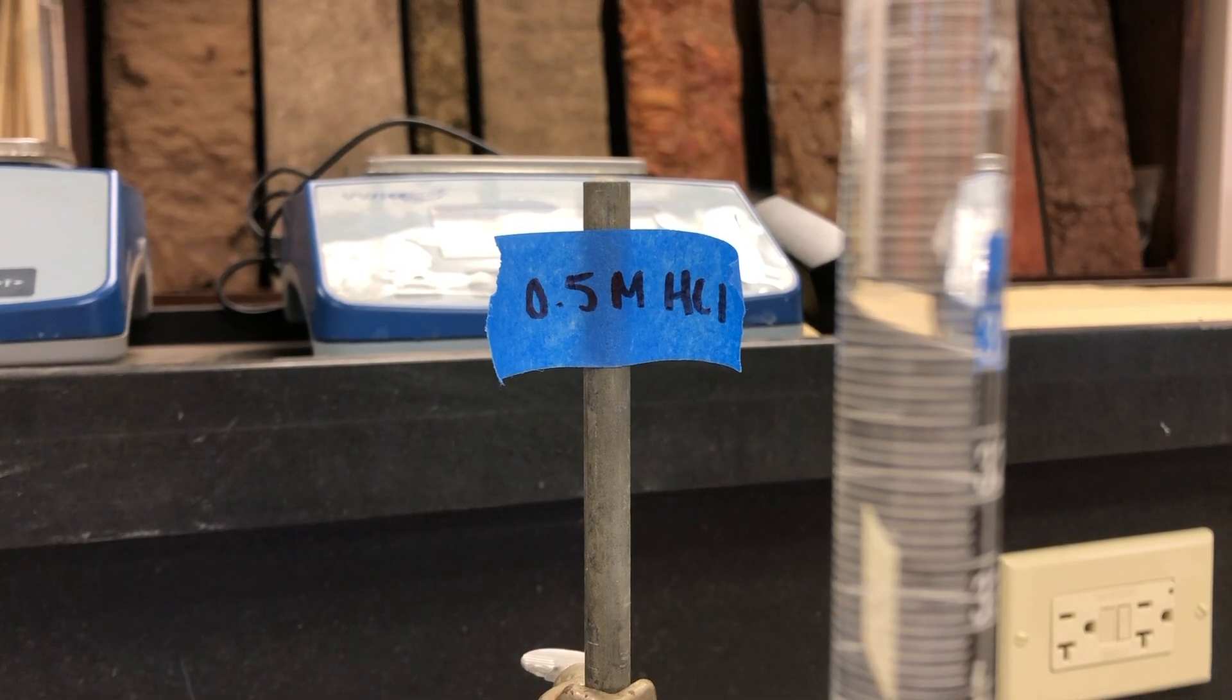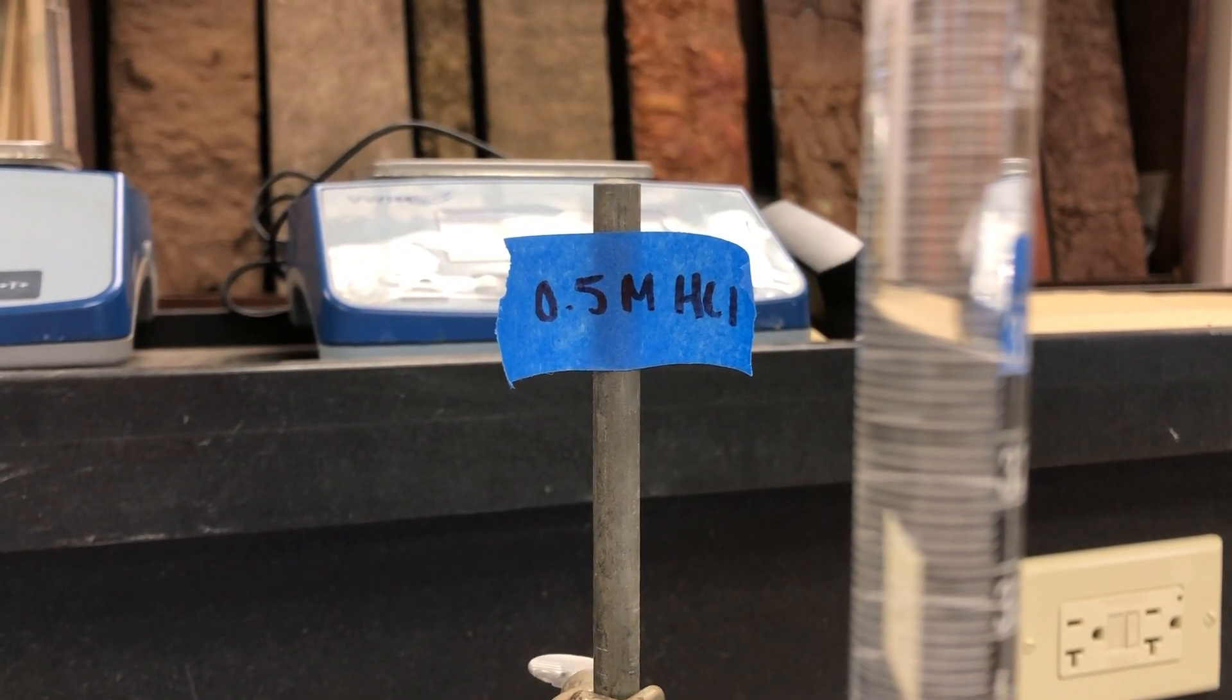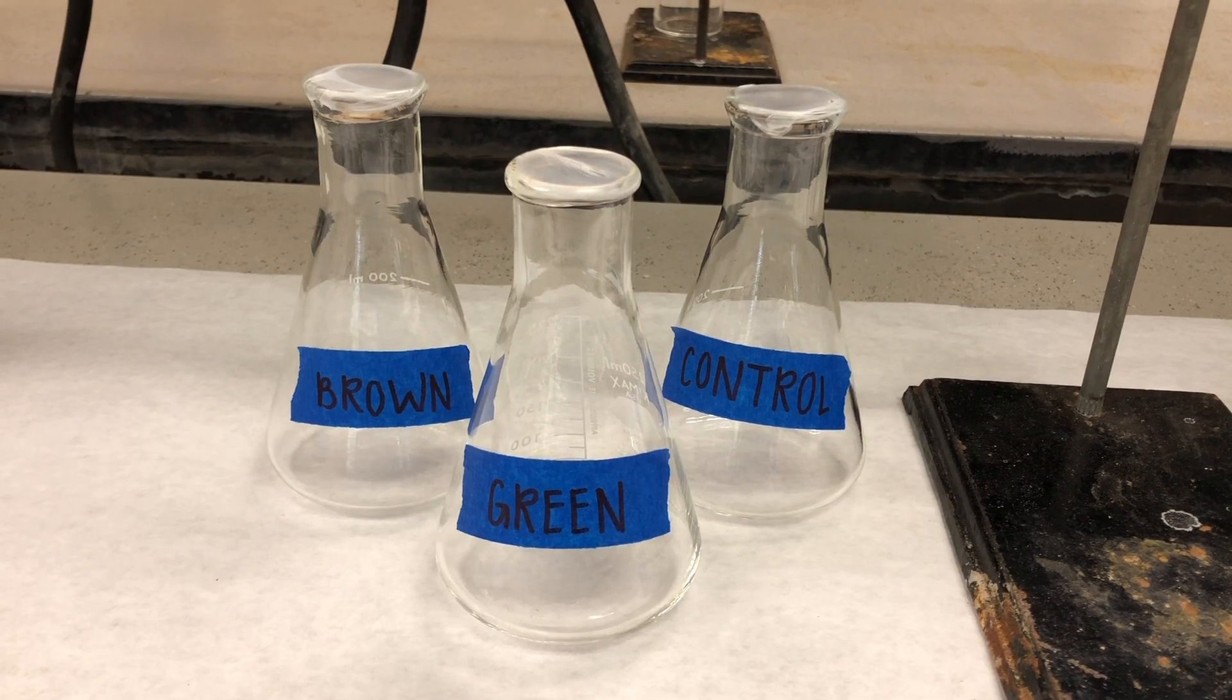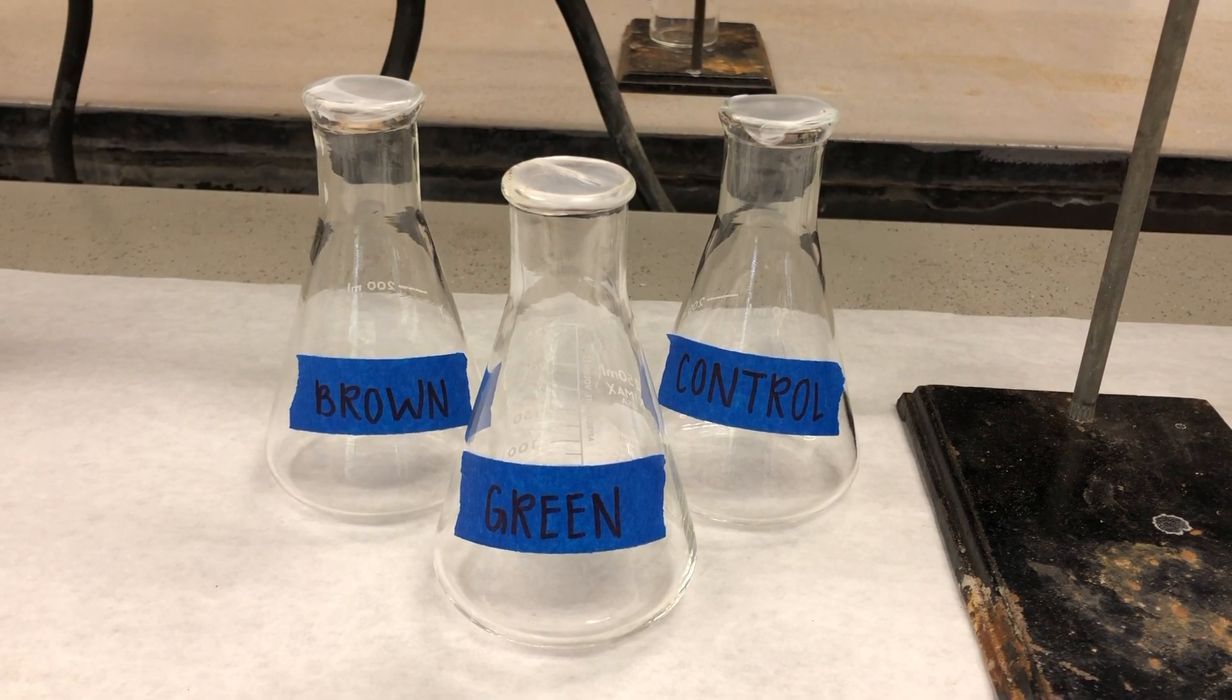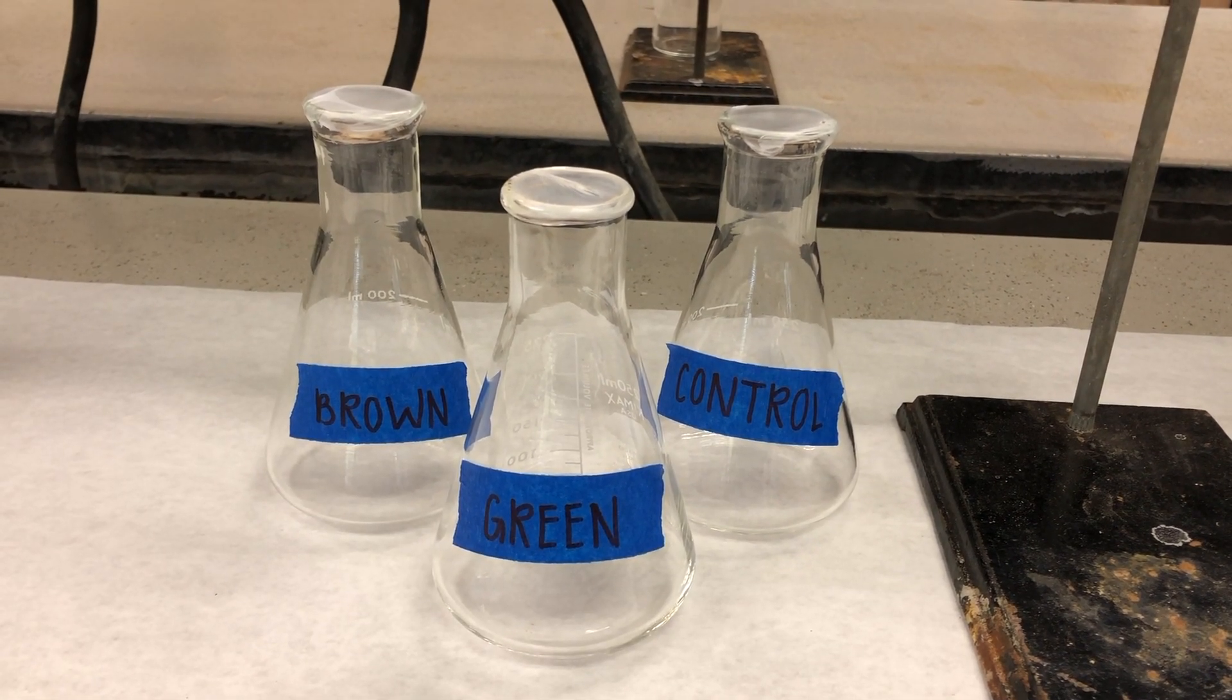The burette should be filled with 0.5 molar hydrochloric acid and labeled accordingly. Before beginning the titration, label three Erlenmeyer flasks with green, brown, and control.